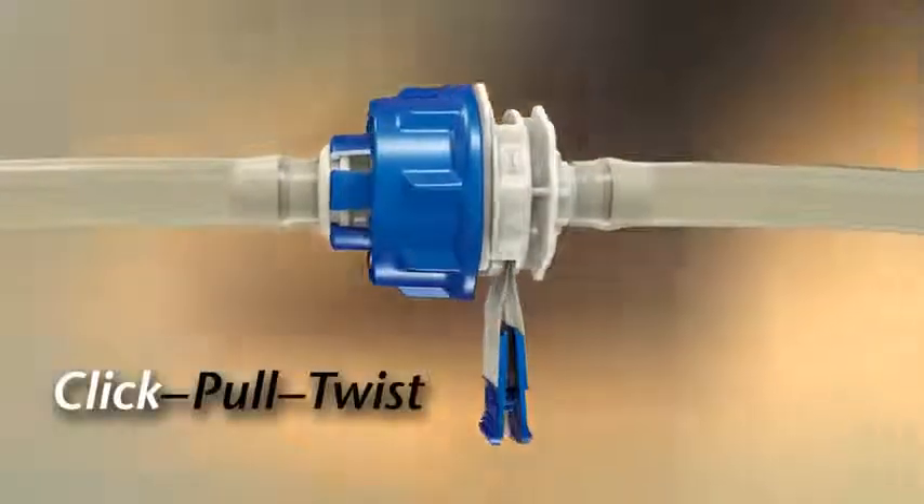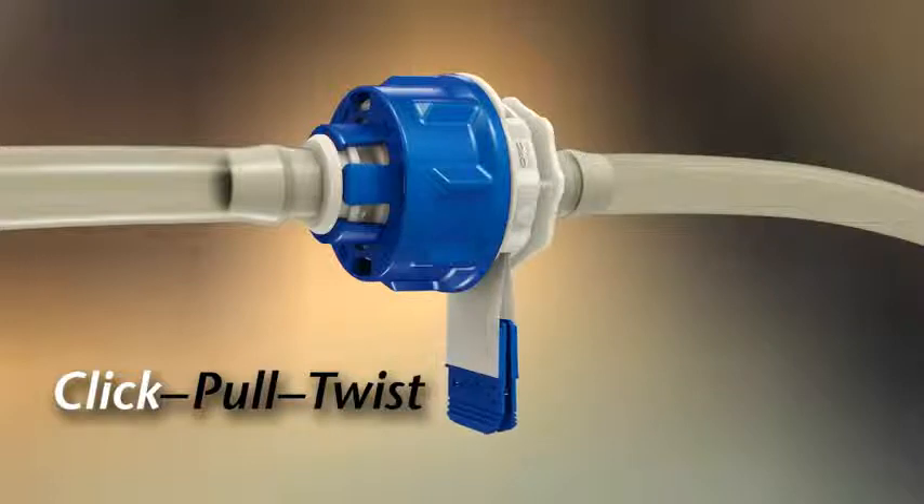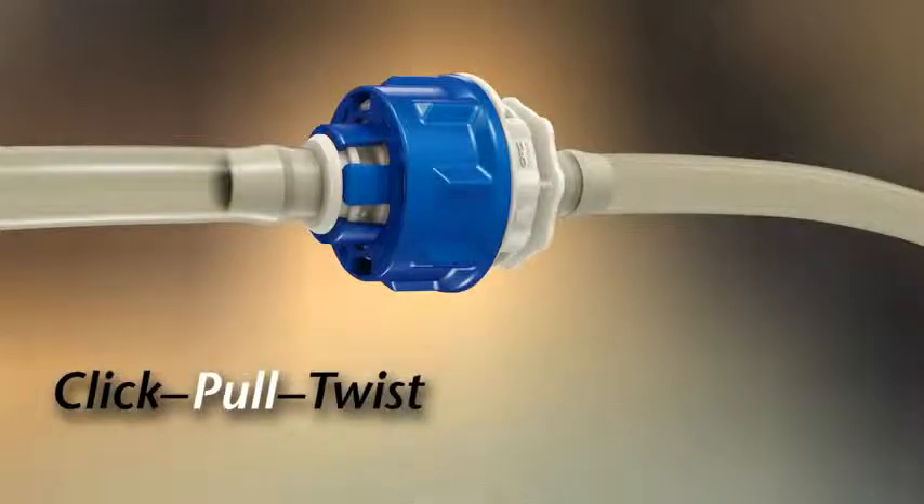To ensure an even removal of the membranes, snap the tabs together and pull the membranes from the connector.